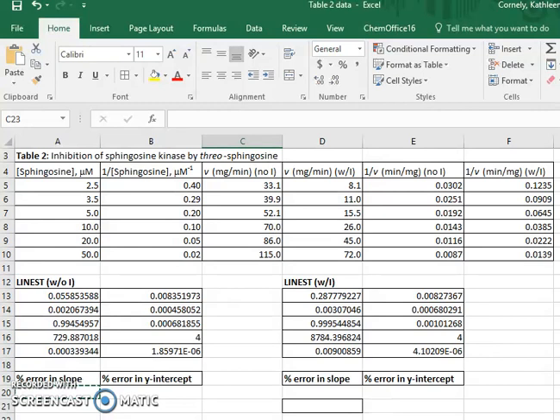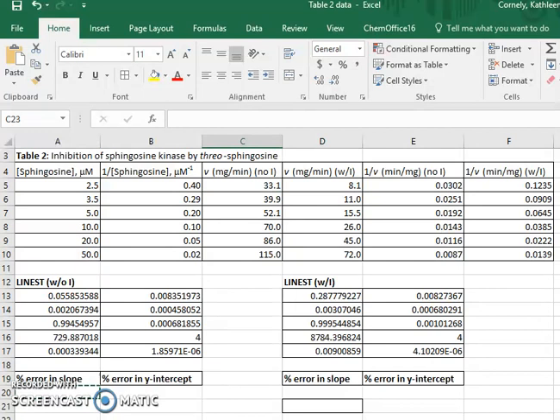The next thing that I want to do is to calculate the percent error in the slope and the y-intercept, both in the presence and in the absence of the inhibitor. I want to do this because later on we will compare values of the slope and the y-intercept in the presence and the absence of the inhibitor, and we need to know whether these values are the same within experimental error or if they are different.